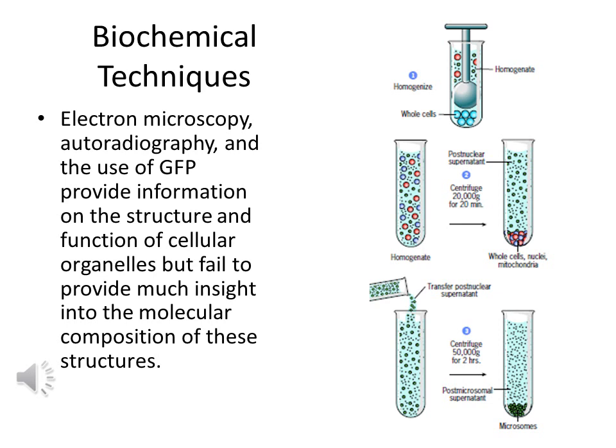Usually when the cells are homogenized and the membranes break, they form 100 nanometer vesicles known as microsomes. These microsomes may differ between the plasma membrane, endoplasmic reticulum and Golgi complex. The microsomes of the rough endoplasmic reticulum are surely different from those of the smooth endoplasmic reticulum, as rough endoplasmic reticulum microsomes contain ribosomes.